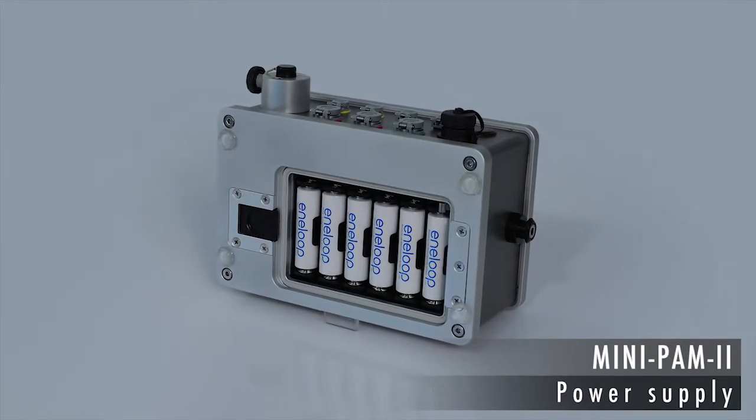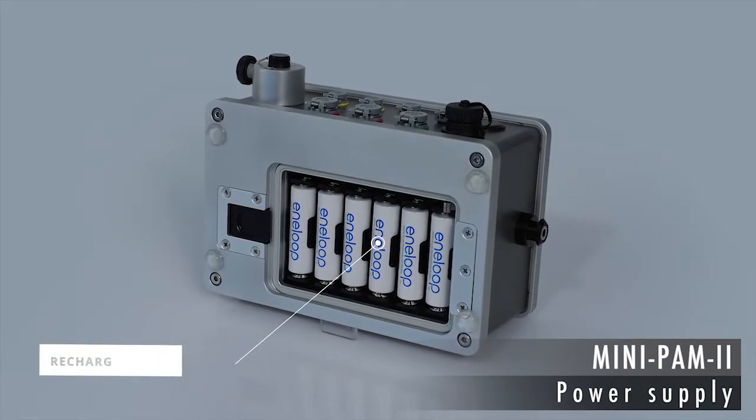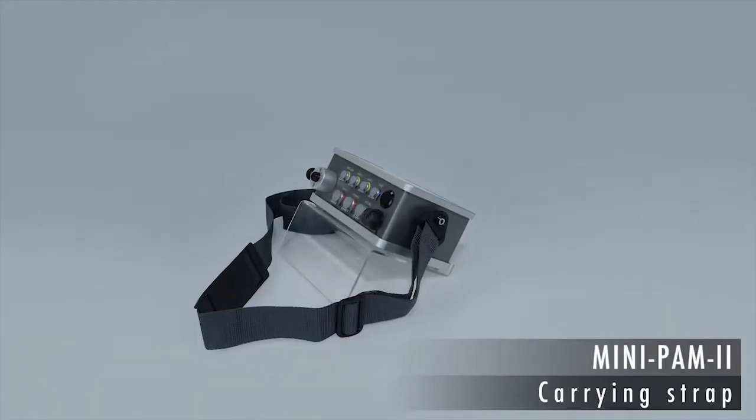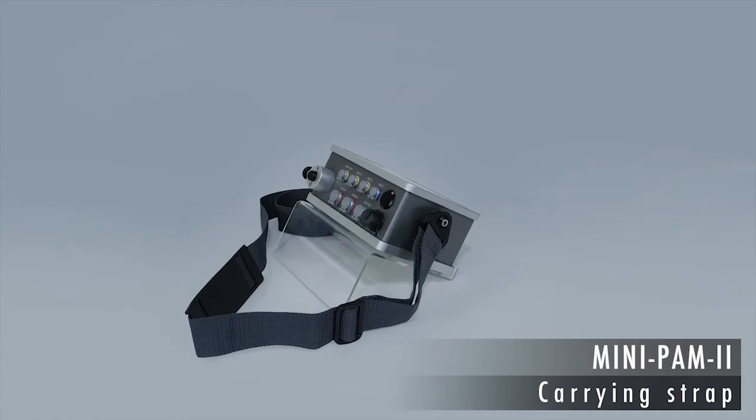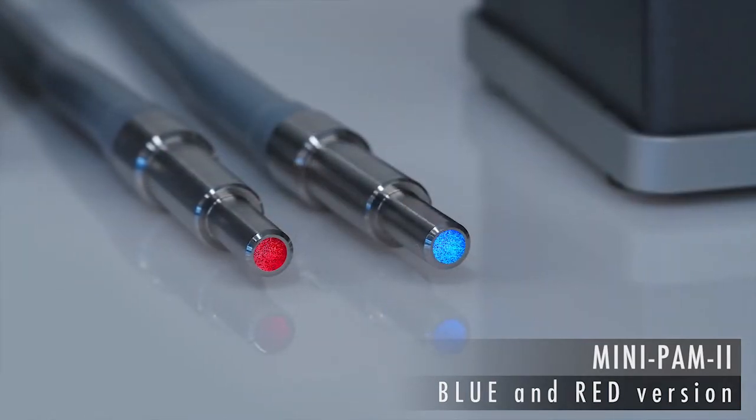The MINI-PAM2 can be powered by widely available type AA rechargeable batteries. The carrying strap greatly enhances the portability and keeps the hands free for manipulations. The MINI-PAM2 is available with a blue or red measuring light.